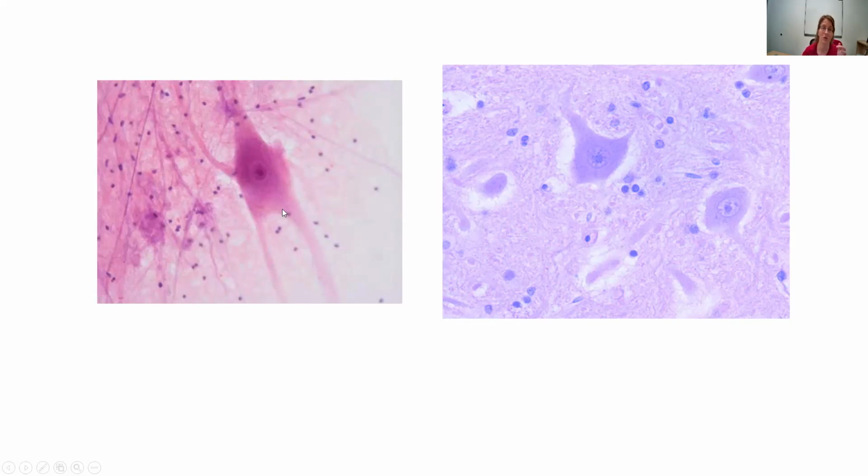These are neurons. The way that I can always tell a neuron is that it looks like a big, irregular shaped cell. This one's kind of more rounded. This one's got a little stem thing. This one has all kinds of little arms and legs. So they're all neurons, but the big way that I tell is the nucleus inside a neuron looks like a giant eye. This looks like an eyeball to me. This looks like an eyeball.